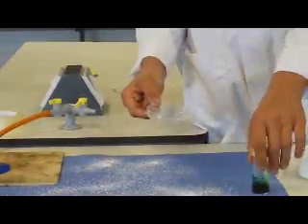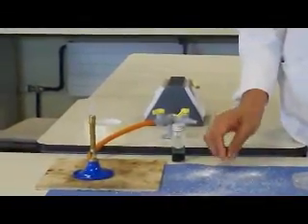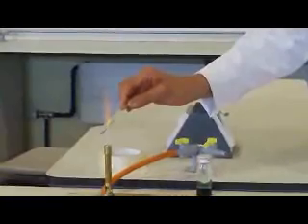Likewise, none of this should end up in the environment. The inoculating loop will of course be contaminated when sitting around in the classroom, so it's flamed to red heat.